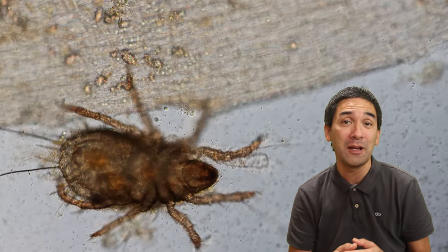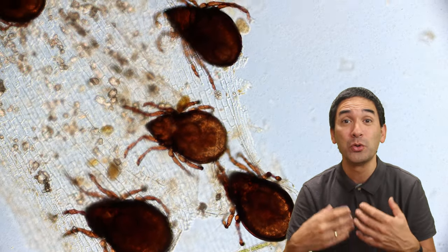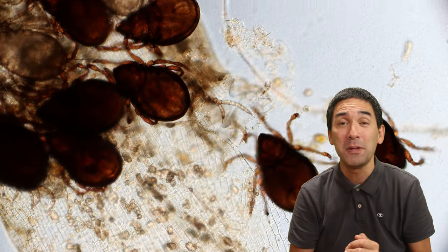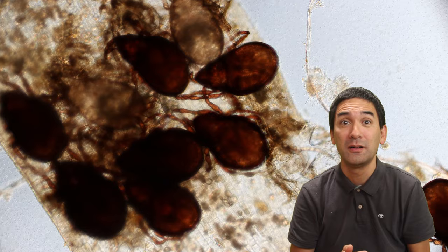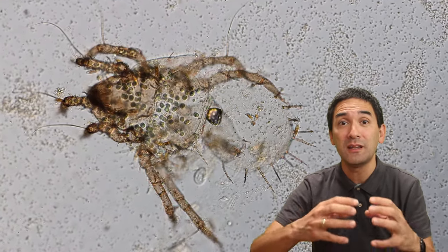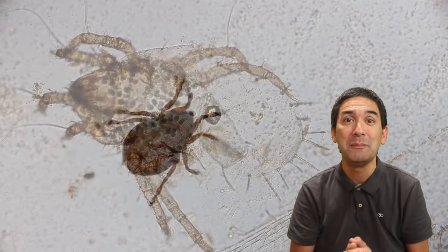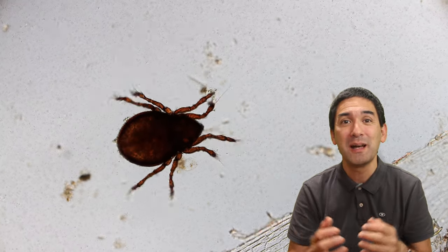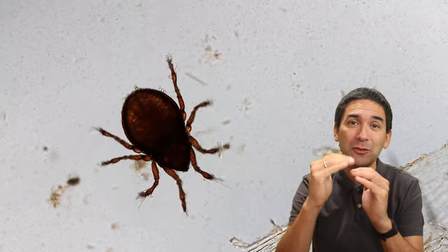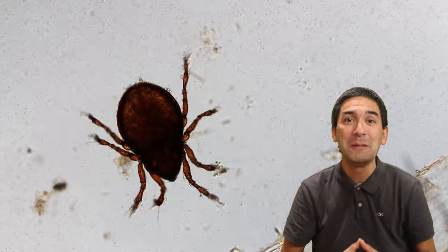Today in this video I would like to not only show you a couple of those mites, but also show you later how I made a permanent slide to prepare a mite. Mites, when they grow, molt — this means they shed off their exoskeleton. In the water sample I even found an empty exoskeleton. This mite has some problems moving forward because it's a little bit compressed between the cover glass and the microscope slide, so the movement is slightly inhibited.